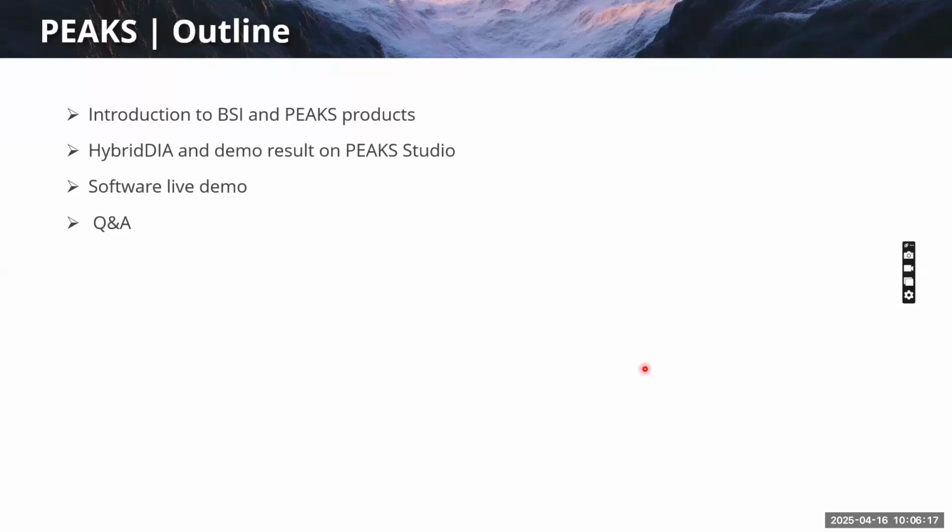Then I will introduce the hybrid DIA method, and we will use a data set from Professor Olsen's paper as one of our demo projects to show the power of the hybrid DIA. And then we will have the live demo. We will show you the software, and finally we will have the Q&A.